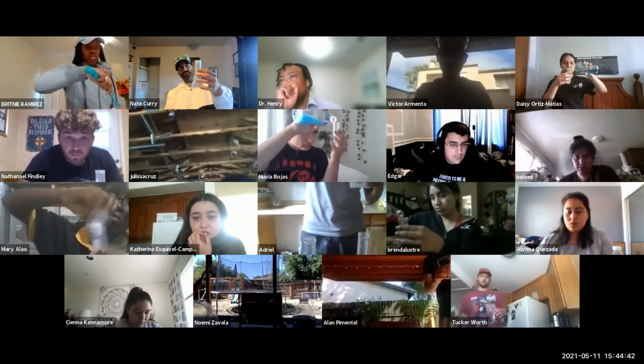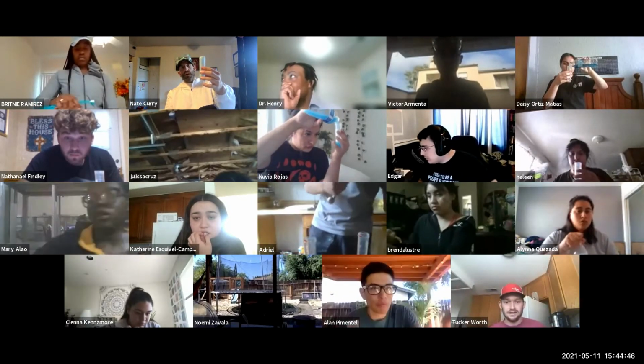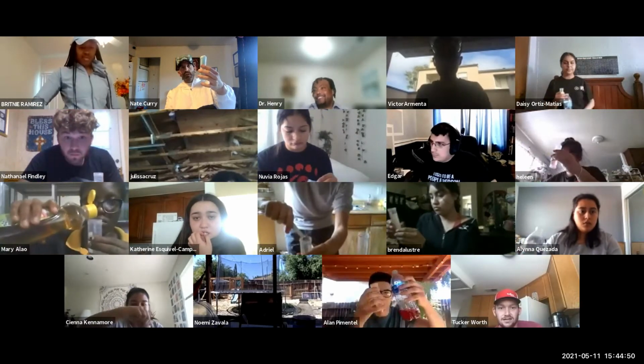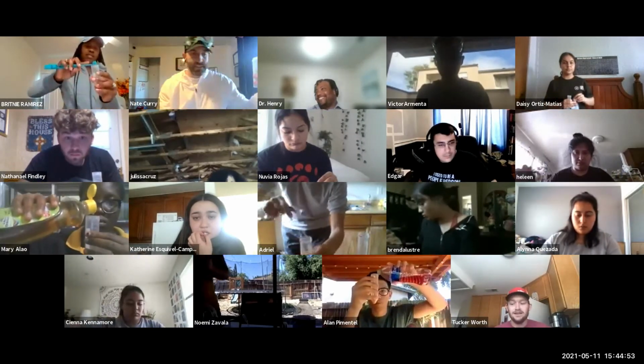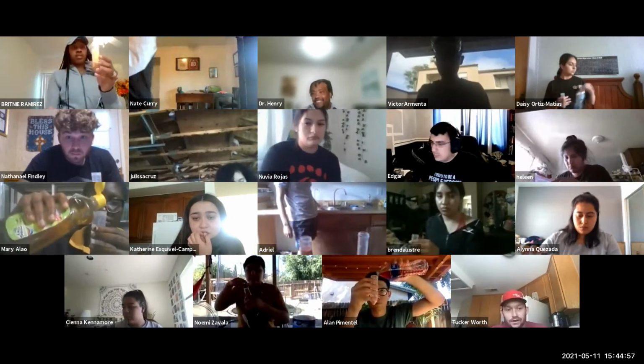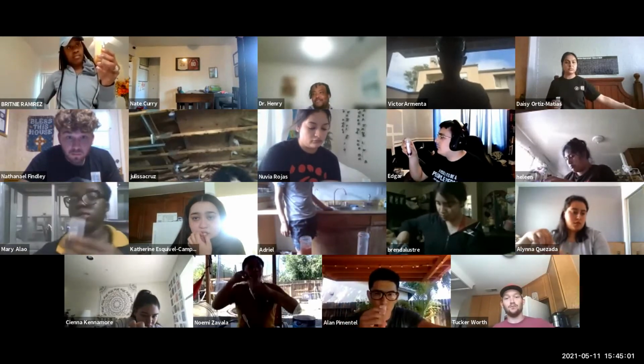Remember when we did elephant toothpaste? Oh, this one's way taller. Oh, it's gonna go over the top. Oh no, no, no, no, no. Oh shoot. So mine stopped for a little bit at like the 45 mark, and then I kind of moved it and it went over.